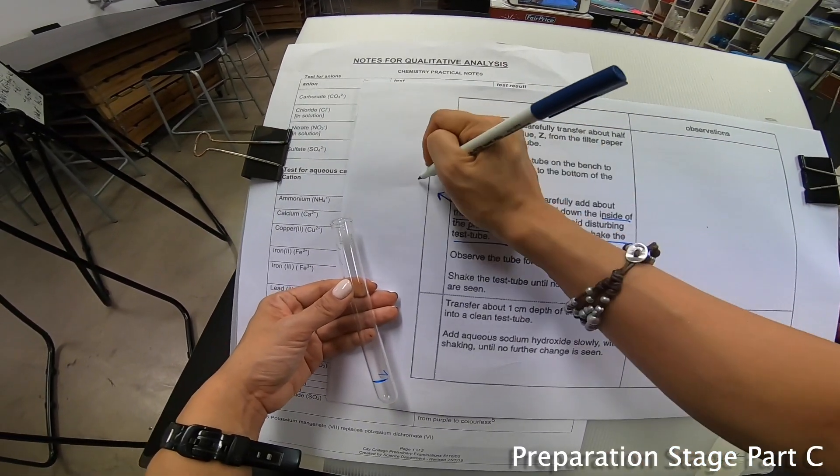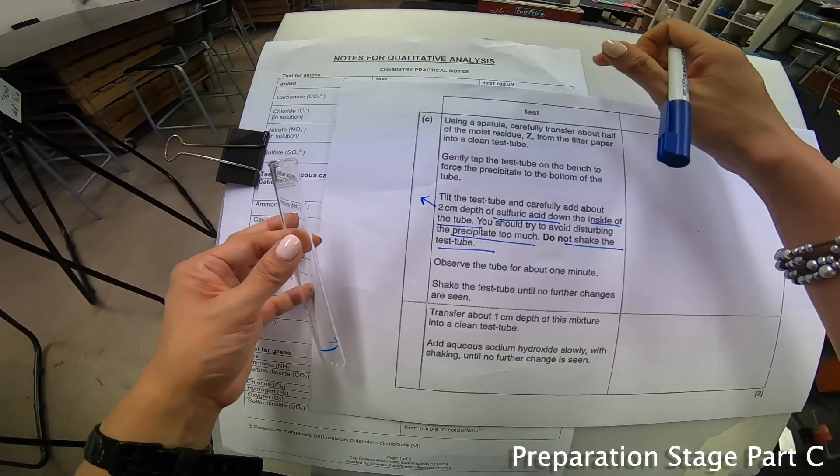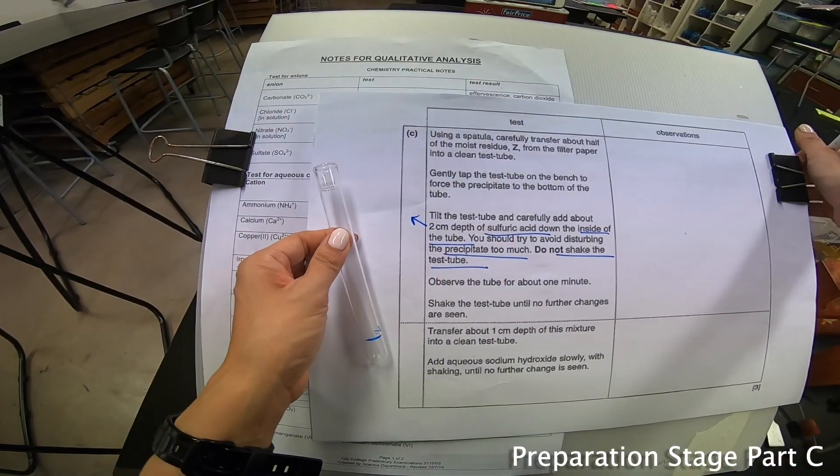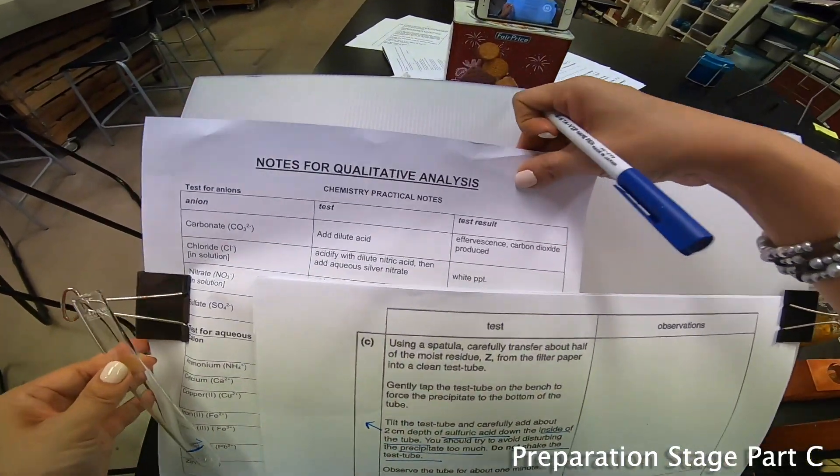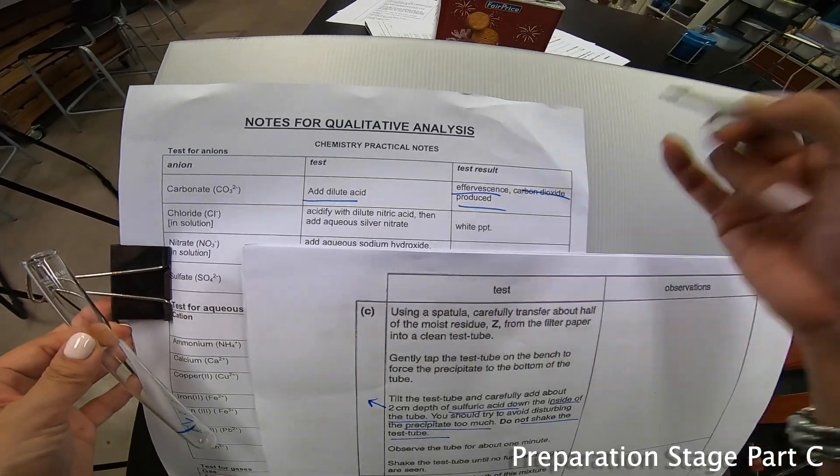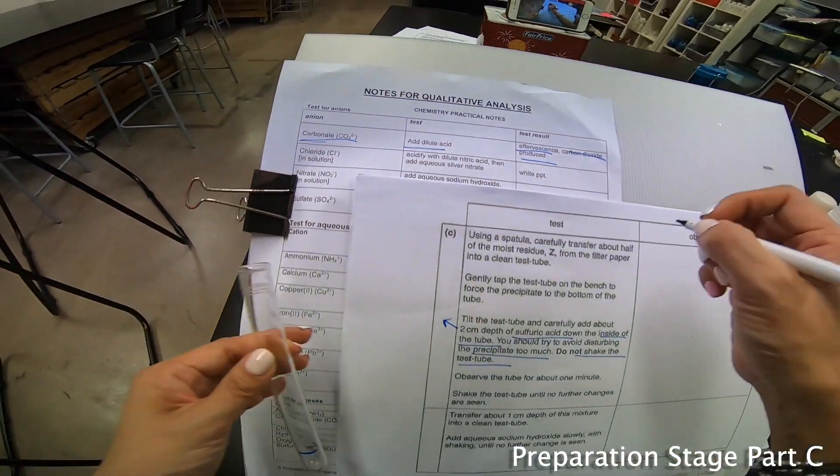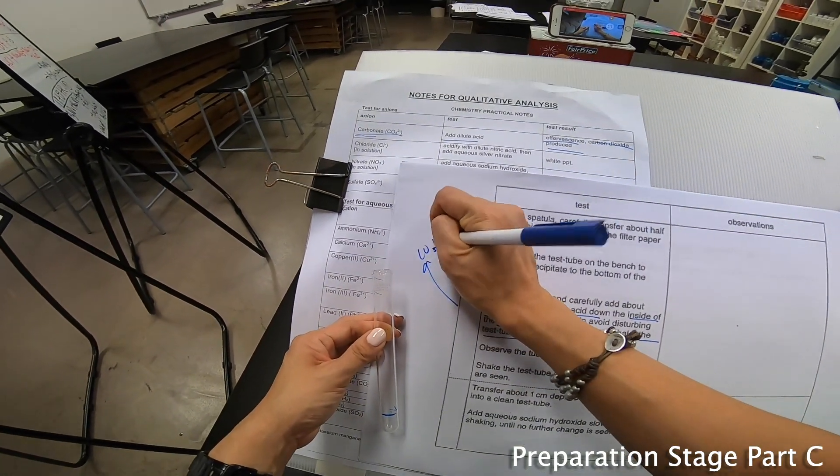Over here, because you're adding sulfuric acid, when I always say adding acid, the chance of it testing for an anion is high, which is none other than this portion here. Adding acid is actually my carbonate test over here, so I'm going to write down CO2 test for carbonate.